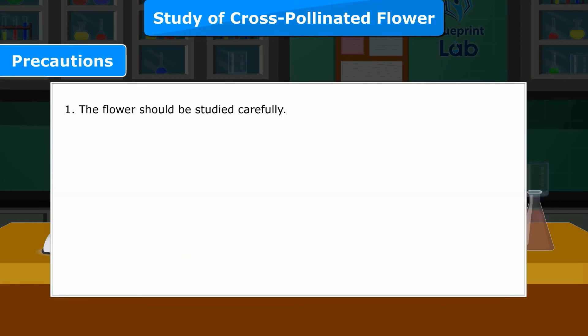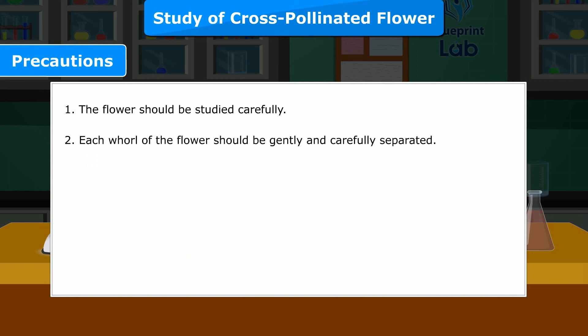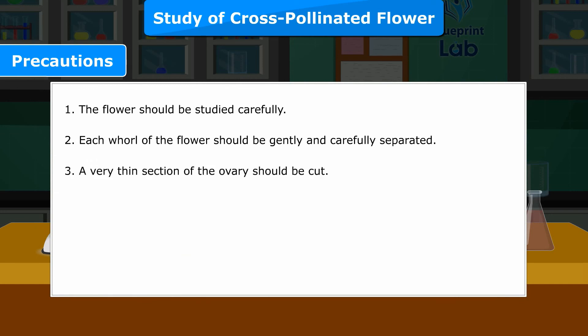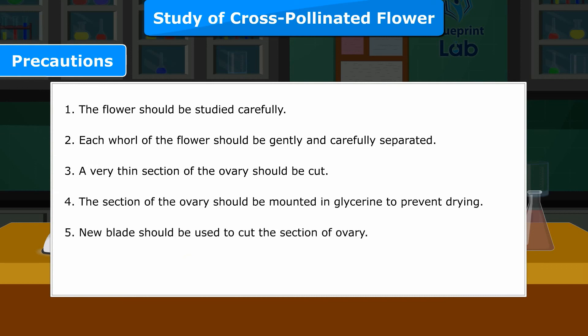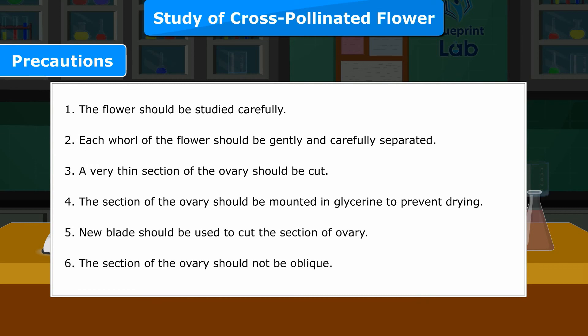Precautions: 1. The flower should be studied carefully. 2. Each whorl of the flower should be gently and carefully separated. 3. A very thin section of the ovary should be cut. 4. The section of the ovary should be mounted in glycerine to prevent drying. 5. A new blade should be used to cut the section of the ovary. 6. The section of the ovary should not be oblique.